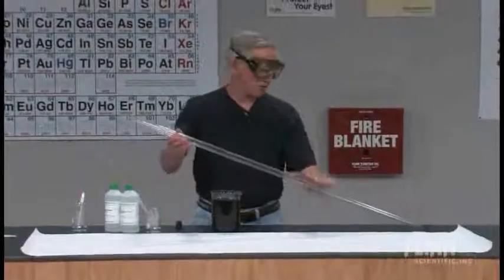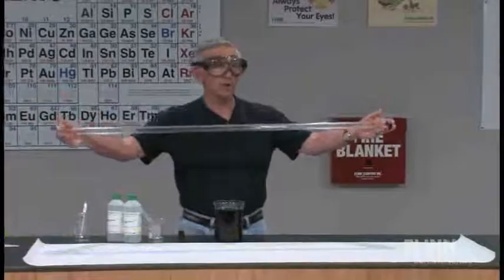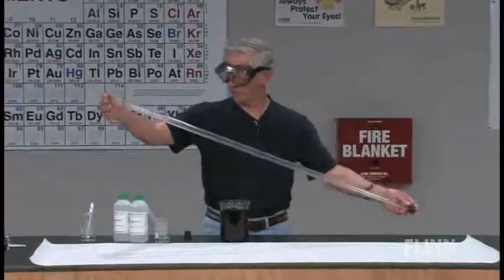I've got a demonstration I want to show you here that I first learned from Bob Becker. It's called a long tube demonstration. I'm not really sure why he called it that.